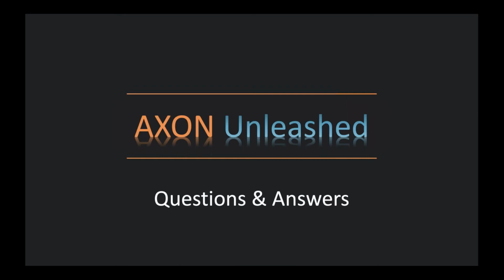For focus, for example, there's some algorithms that can be selected as well for the user, and even down to session management, file locations, what information is saved, raw, corrected, non-corrected, all of them. All of those things are adjustable. There's a wide variety of parameters, and I think some of that showed in that video I mentioned.